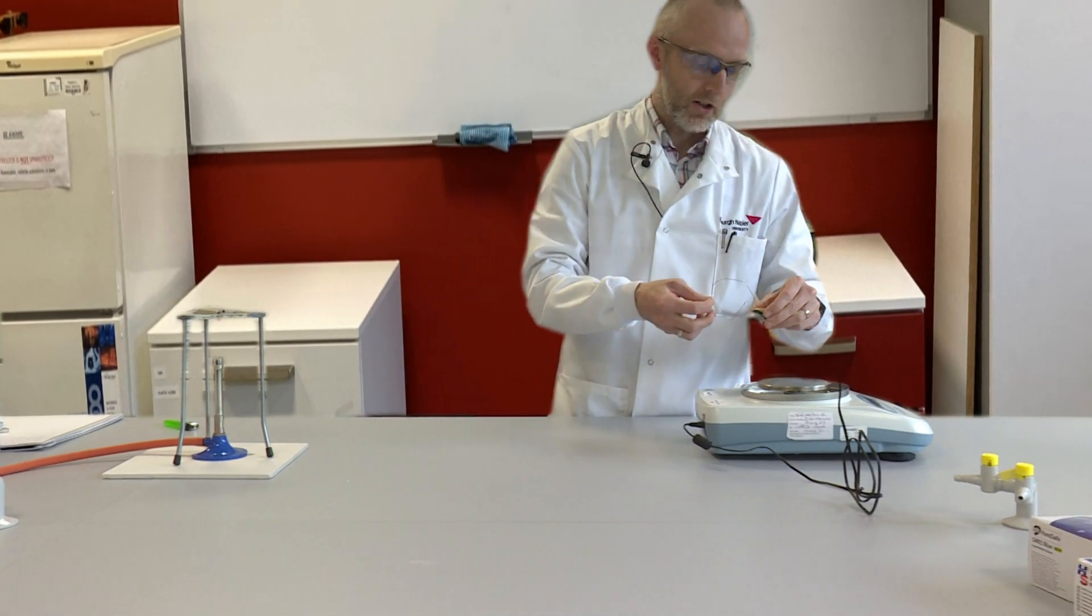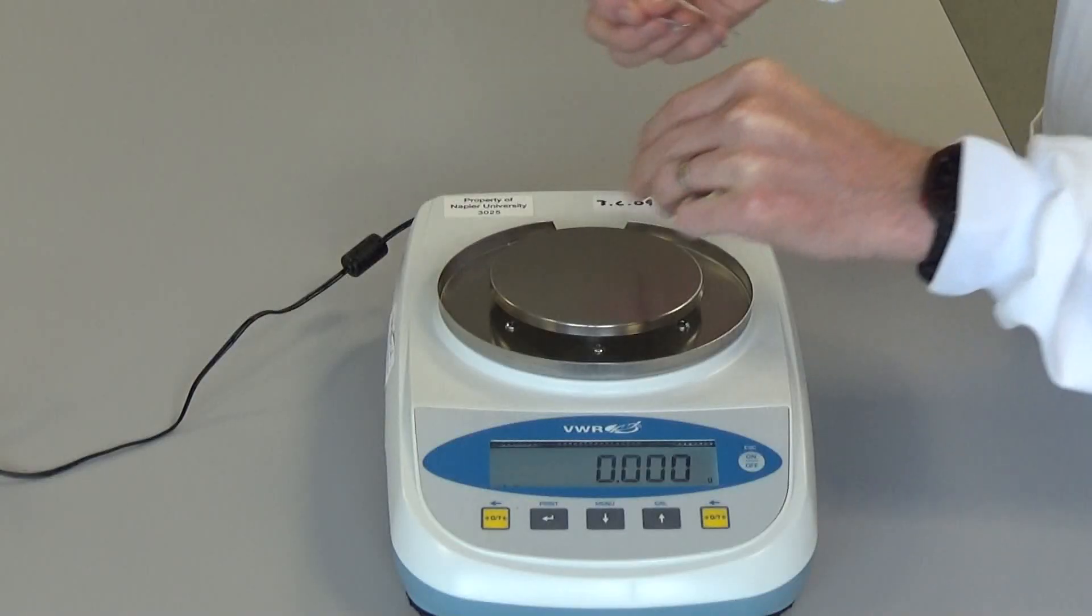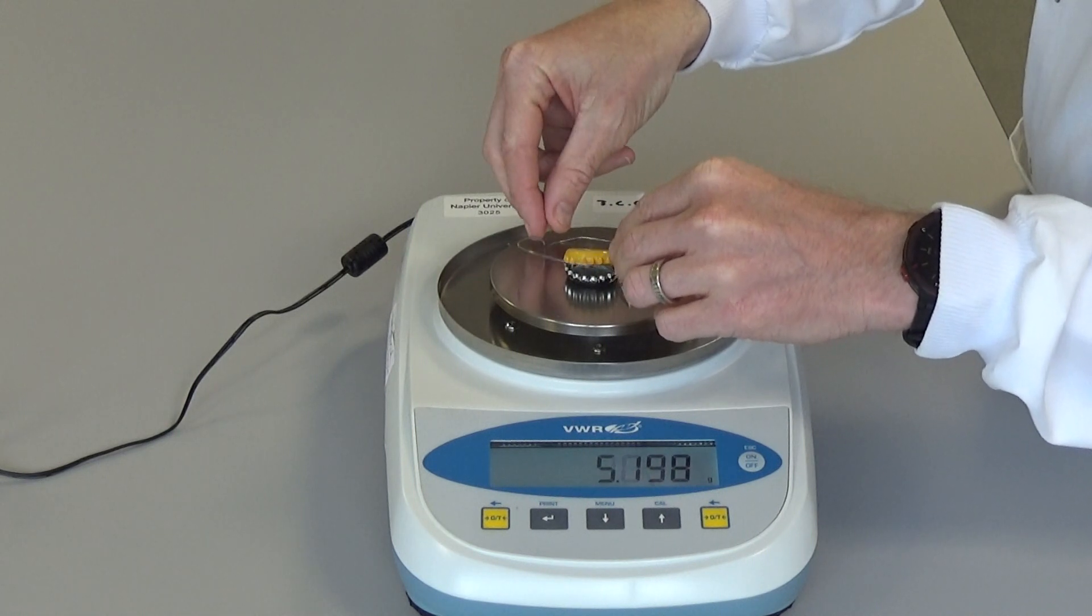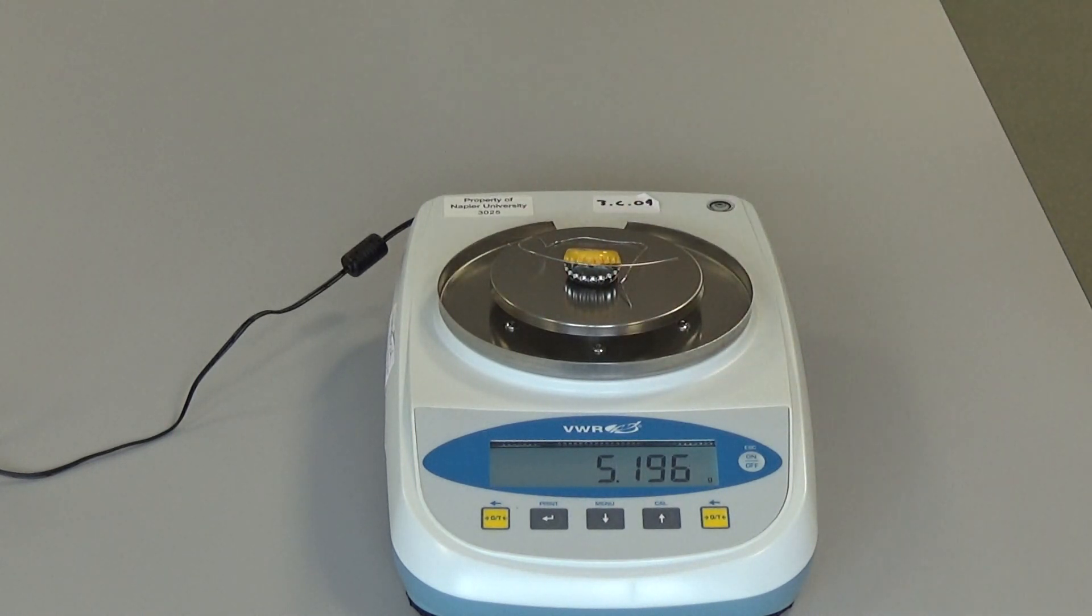So the first thing I'm going to do, I'm going to heat it inside these bottle tops held together by nichrome wire. So I'm going to take the mass of the two bottle tops I'm using and the nichrome wire, and that is a mass of 5.196 grams, so I'll take a note of that.